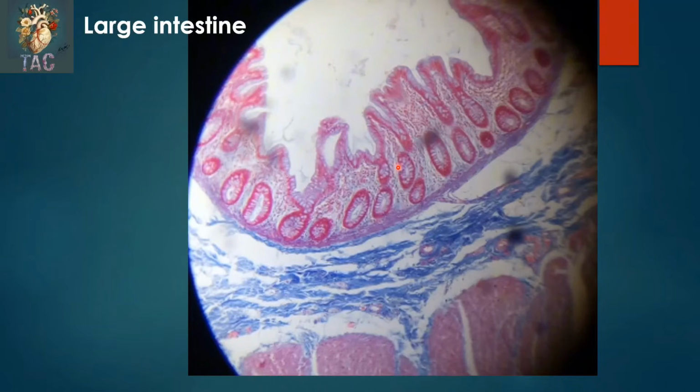Second important point is a large number of goblet cells. The number of goblet cells increases down the tract, and at the end of the large intestine it may be a 2:1 ratio, 2 columnar cells to 1 goblet cell, or either a 1:1 ratio may be present. This is the boundary line where the muscularis mucosae is present. This one is the submucosa, and here you can see the muscularis externa.